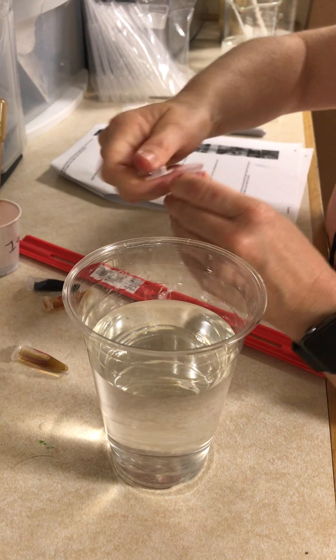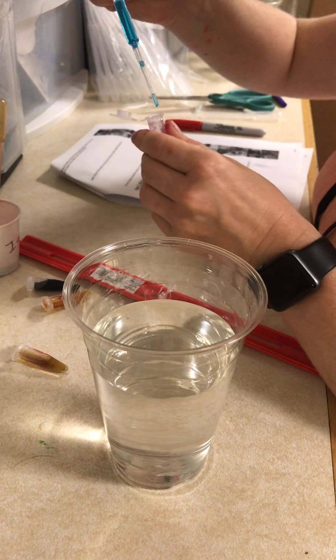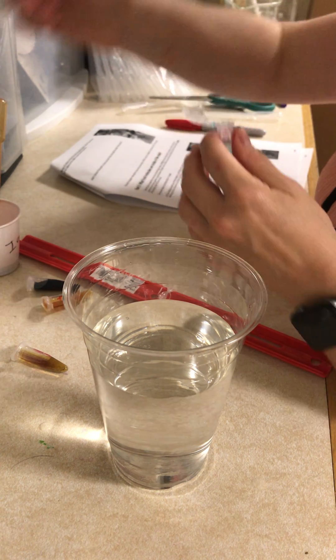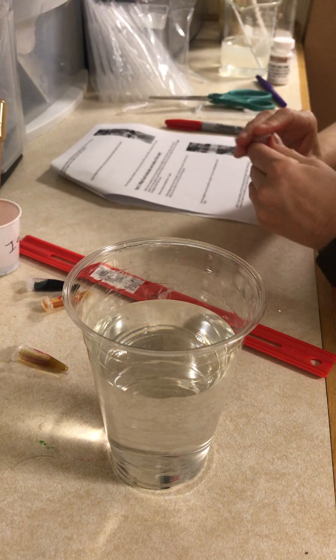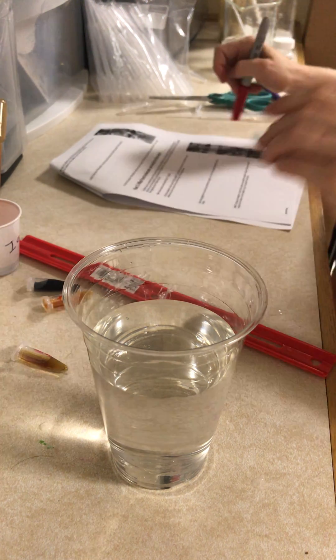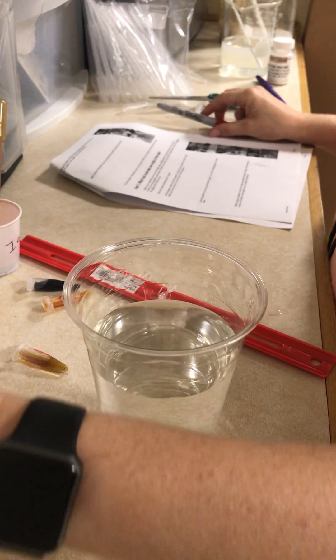In the second inside tube, I'm going to add five drops of Benedicts — one, two, three, four, five. I'm going to label this one 'inside plus Benedicts' and put this tube in the cup with my other two tubes.